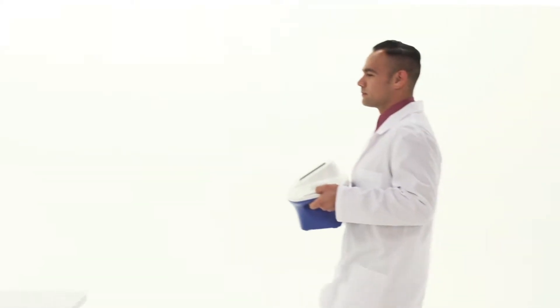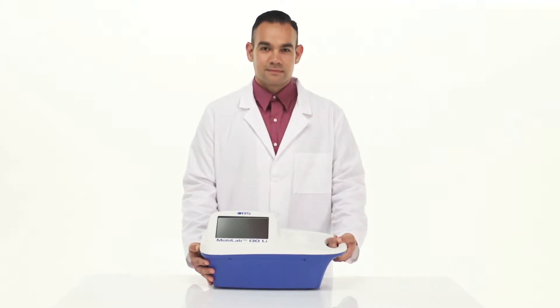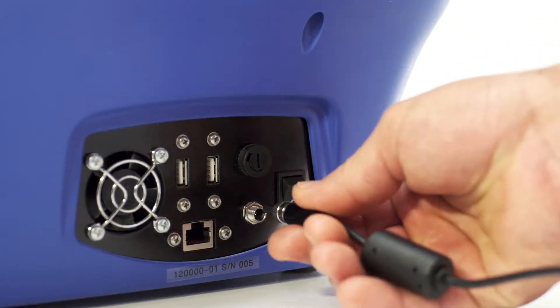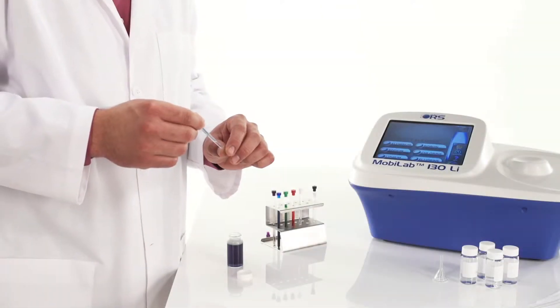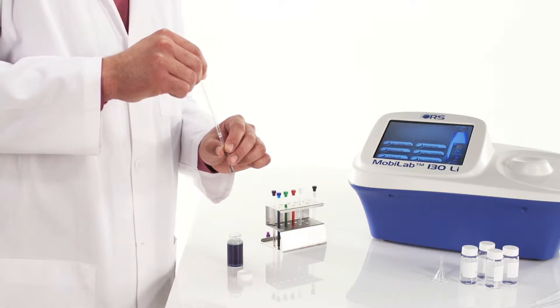The MobileLab 130 brings the benefits of magnetic resonance to any testing environment, providing chemical analysis on demand and in less than one minute. Measure single element or multiple element concentrations precisely with one easy-to-use compact instrument. The MobileLab 130 makes chemical testing intuitive using a simple single point testing preparation.